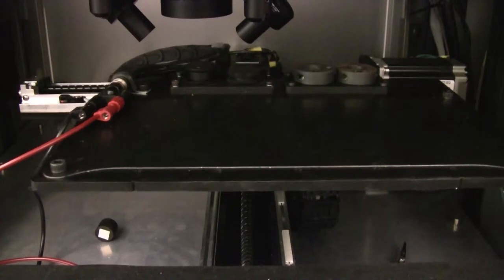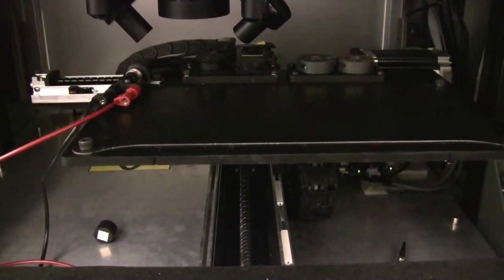Tau Science uses this tool to help Solar World look at their solar cell and find out the efficiency mapping. And we have an FTIR tool.